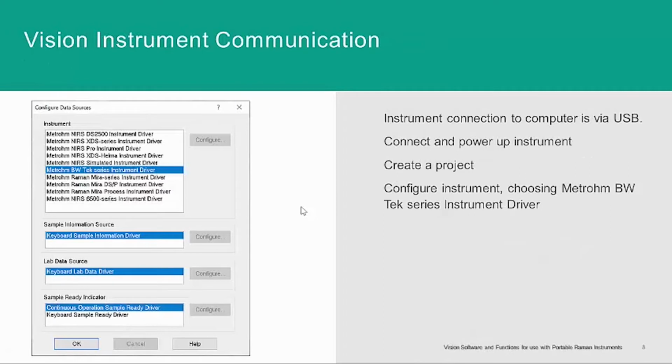Then when you connect to an instrument, you will want to choose the Metrohm B&W Tek series instrument drivers. The instruments are connected via USB, and the drivers can be seen under the device manager to see that they are properly connected and configured.